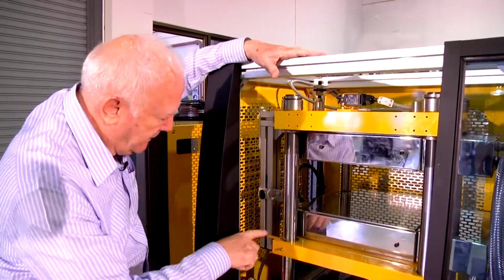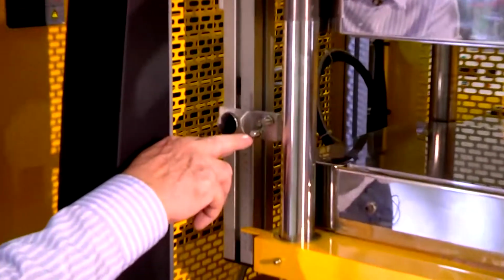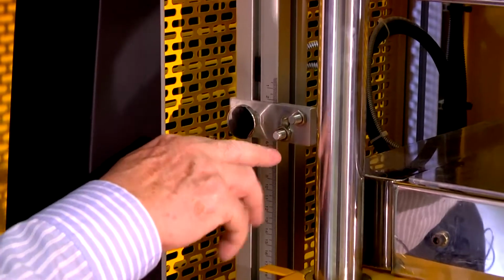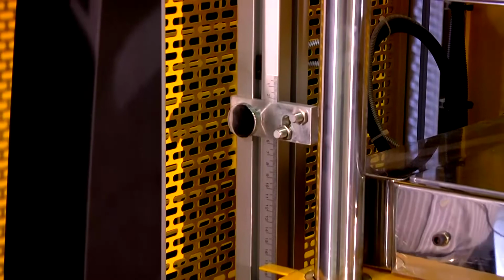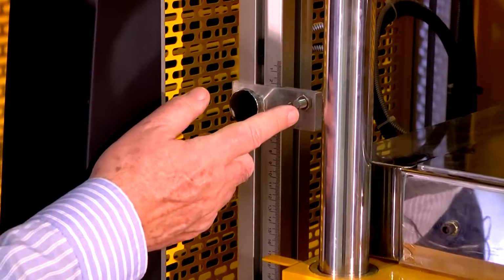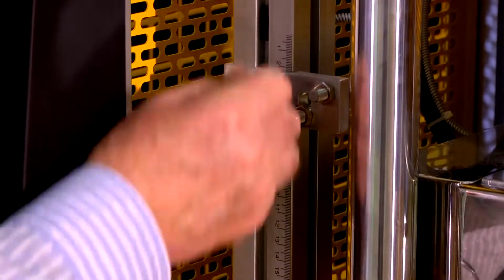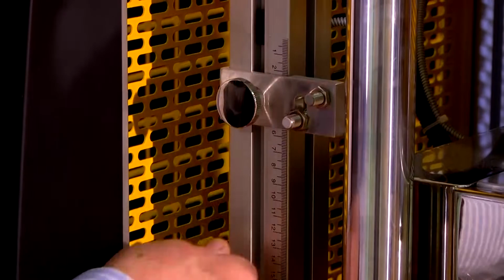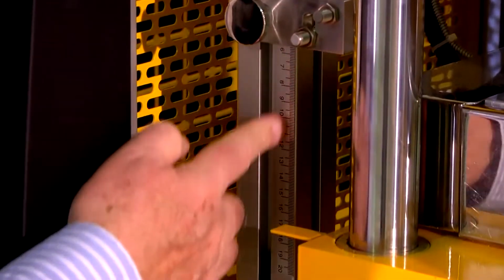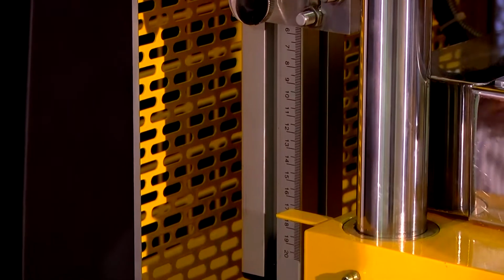And this will come down to this other proximity switch, and then immediately go back and complete the full pressing cycle. So these two are for venting and for preheating. And we can set the positions of these, and there's a calibrated scale here for recording the setting.